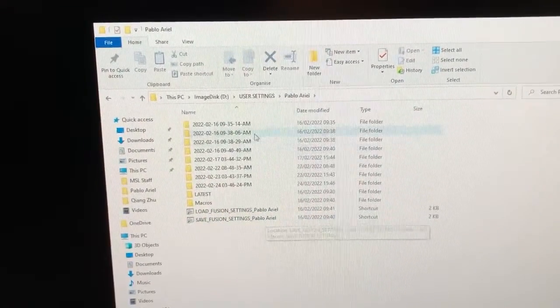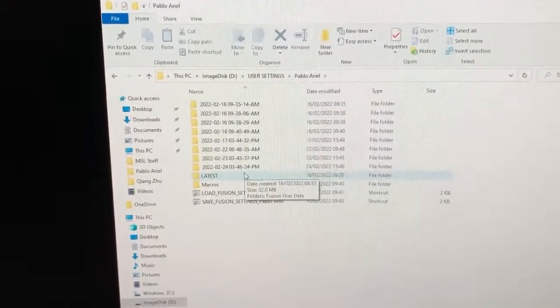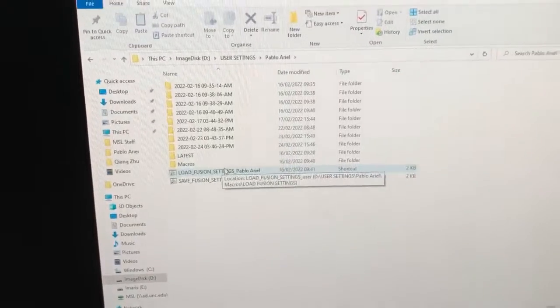If you double click on that macro it will create a folder with your settings for today with a timestamp, and it will also put your settings in a 'latest' folder so that you can recover them later with the 'load fusion settings' macro.